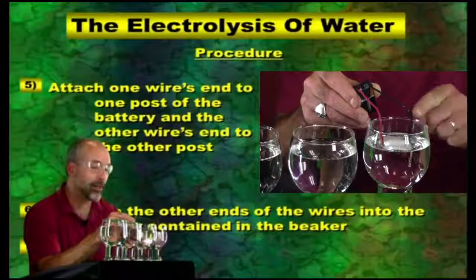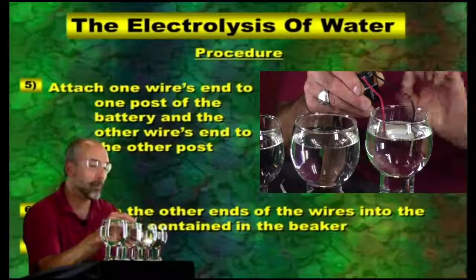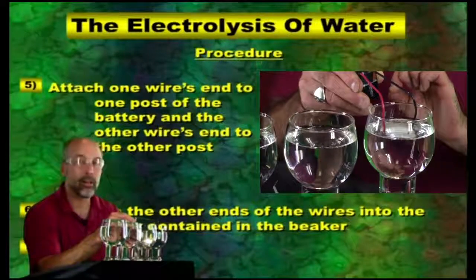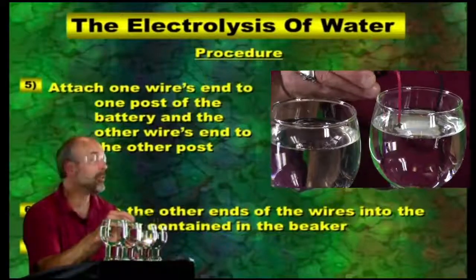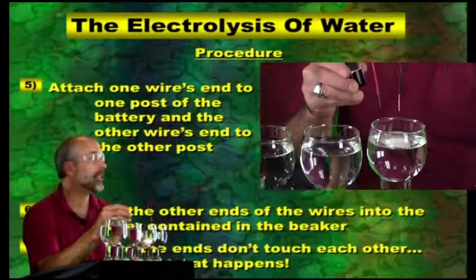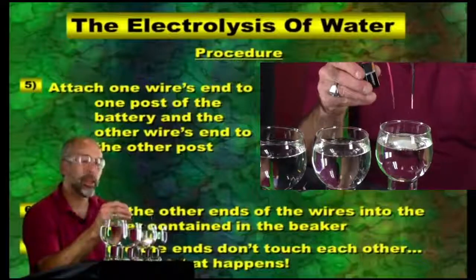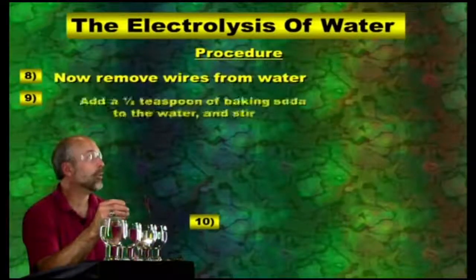Now, as I look at this a little bit, I see coming off the black wire a tiny bit of bubbling there. But that could also be because of contamination in this container. So with that said, I write down what I'm seeing here, and I say, you know what? I don't think water is a good conductor of electricity. We went ahead and did it.